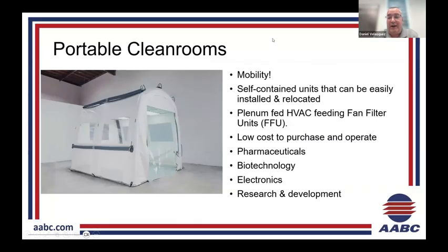Portable clean rooms. The biggest thing about portable clean rooms is the mobility. They're self-contained units. They almost always have a blower unit somewhere on the side or the back of it. There are different manufacturers. Bio bubbles come to mind, where all the ducting is actually sewn into the fabric of the clean room itself. It's got a little blower unit with a HEPA filter in it down below in the back, and then it just blows it through the fabrics.